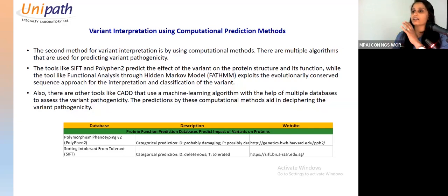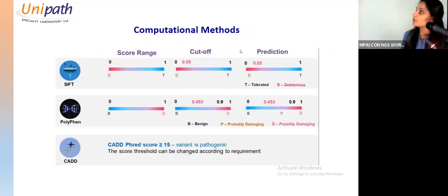So basically, this whole analysis is nothing like black and white. It's all gray. Every time it's your decision, and everything depends on your decision, where experience matters. So that's why I told you to consider 3 tools.